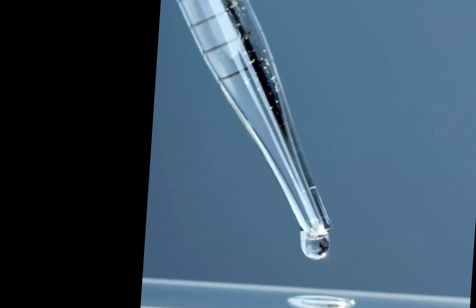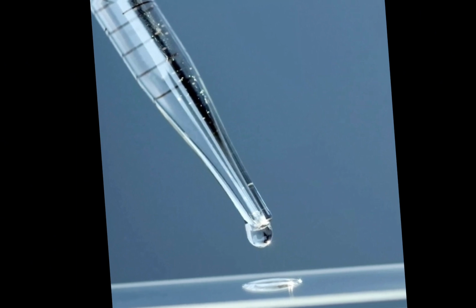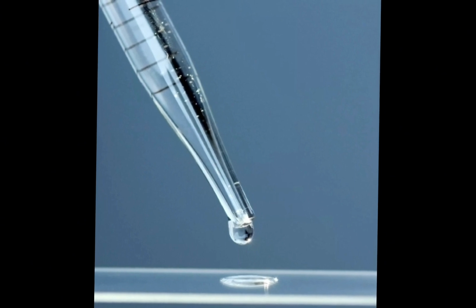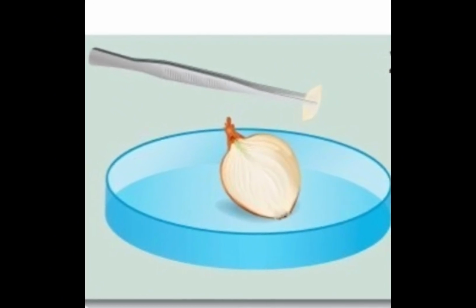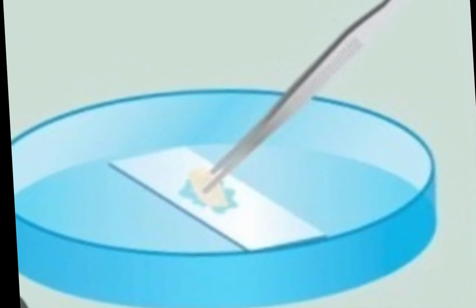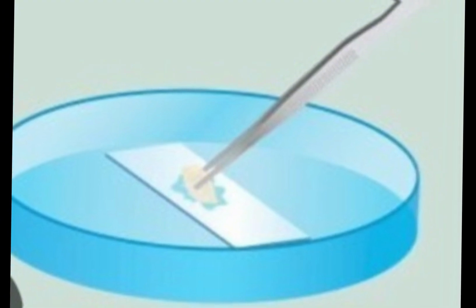Now we are going to look at the procedure that is followed in this practical. First, we need to add a drop of water at the center of the microscopic slide. Having pulled off a thin membrane from the onion layer, we are going to lay it at the center of the microscopic slide. That drop of water will help flatten the membrane.